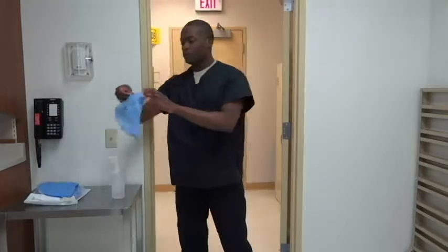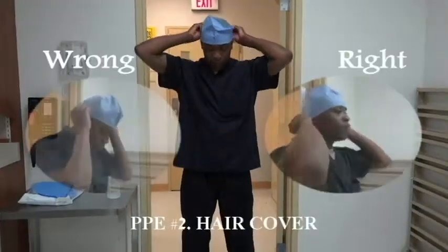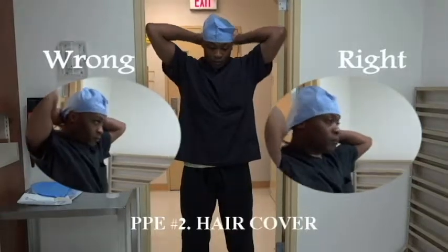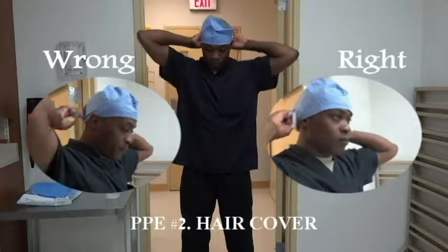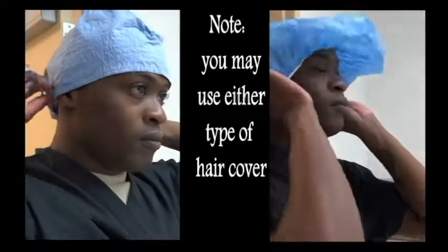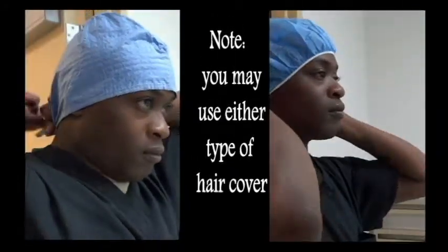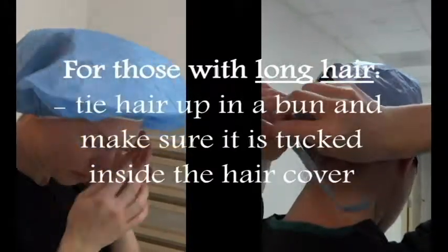Don hair cover. Cover your ears and make sure hair is tucked inside the hair cover. You may use either type of hair cover. For those with long hair, tie hair up in a bun and make sure it is tucked inside the hair cover.